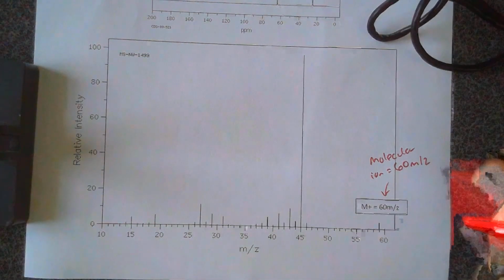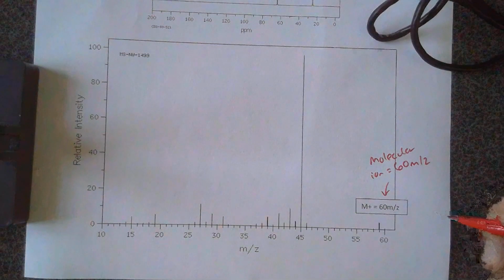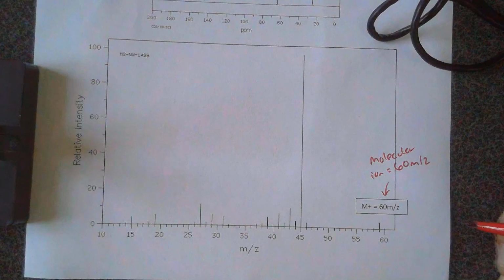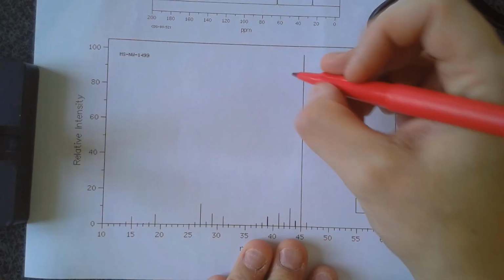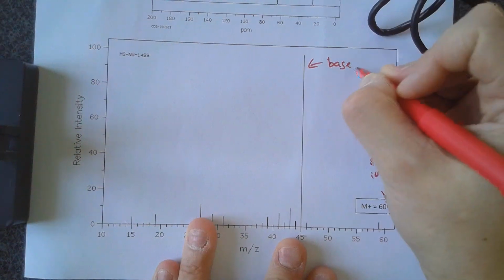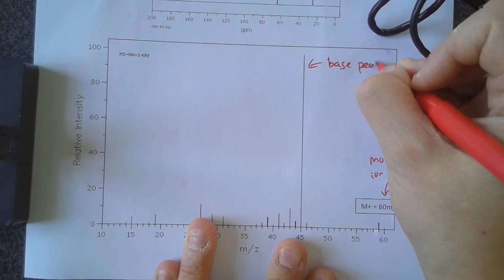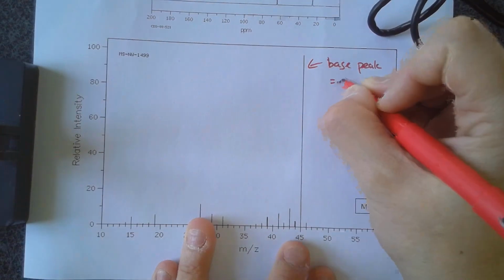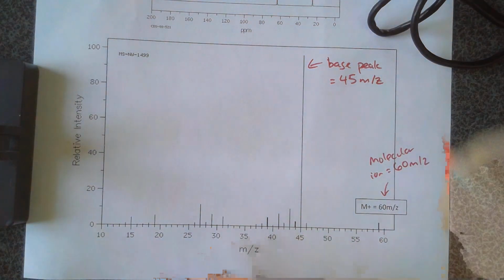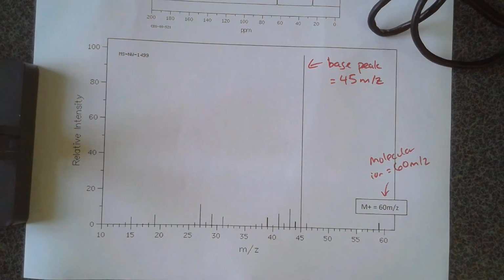The other thing I need you to do at the achieved level is label the base peak. So the base peak is at 45. So remember that base peak is talking about the most common fragment that we see.